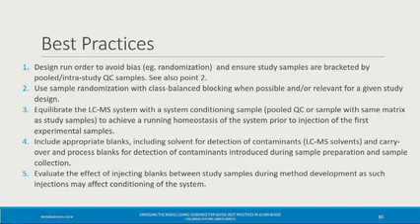Personally, we like to do at least beginning, middle, and end for those long-term QC type of injections, to have at least kind of triplicates at a minimum to have an idea. But if you can afford it and your methods are short, you can always add additional injections as needed. My recommendation, from my own lab, is beginning, middle, and end, and that gives you enough control over what's happening in each of the batches when you try to align things across the batches.